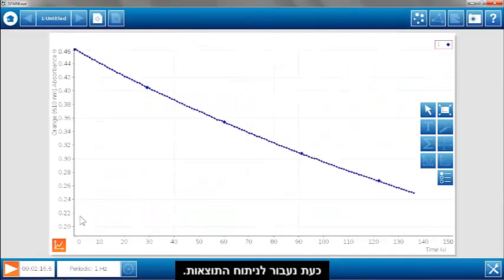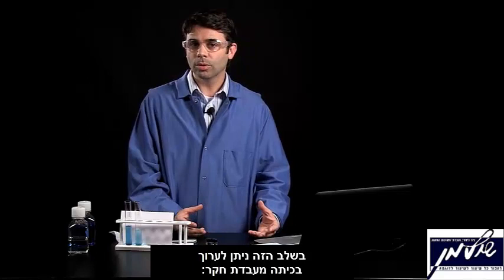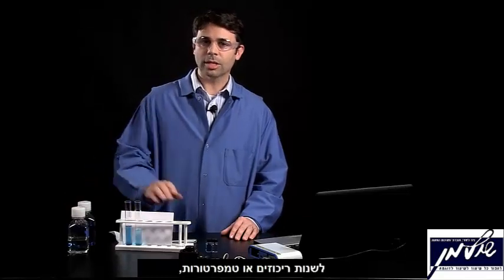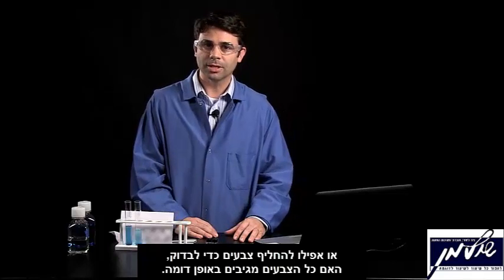And this is a good place to do some analysis. So I'm going to stop the data collection. For an introductory class, this might be a good place to have an inquiry lab. Have the students design experiments to make the reaction happen faster or slower, changing concentrations or changing temperatures, or even changing dyes to see if all dyes react in a similar fashion.